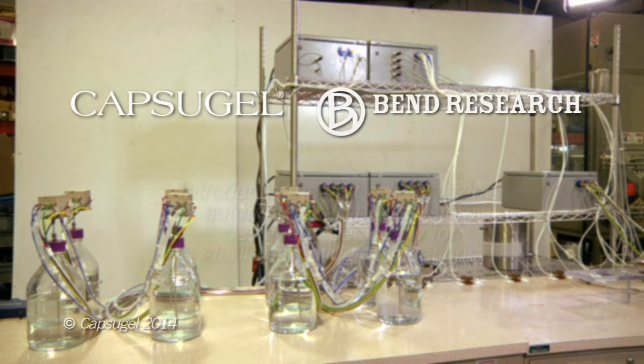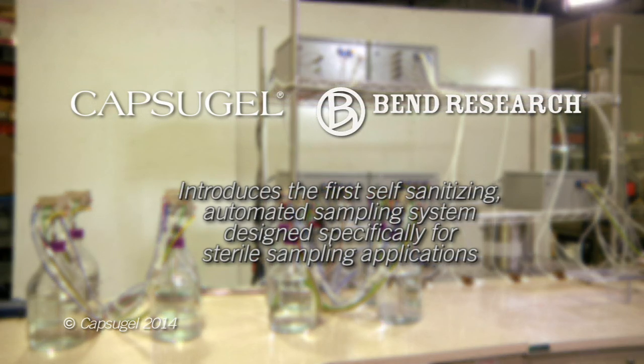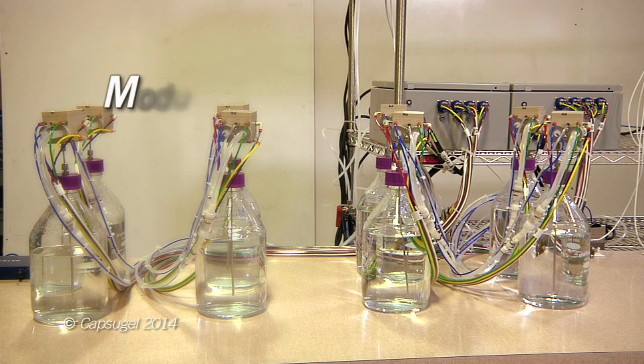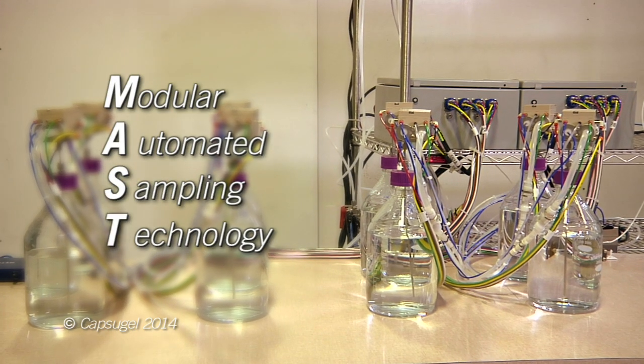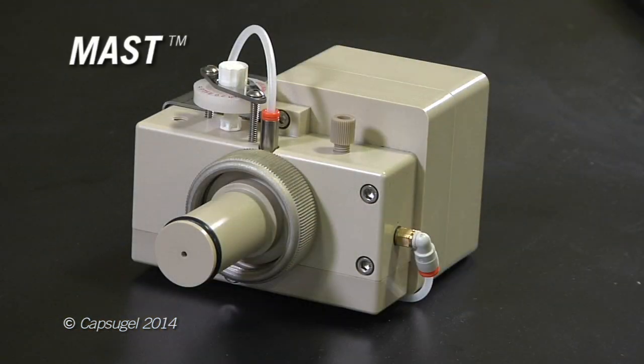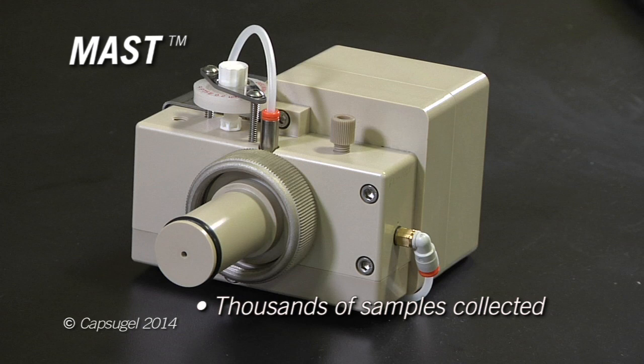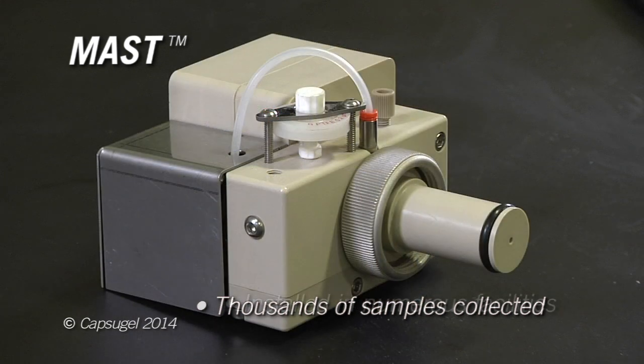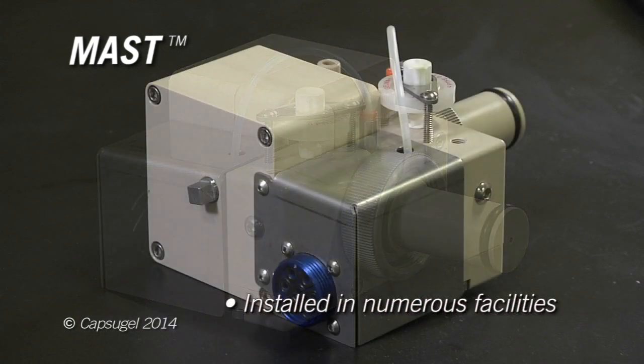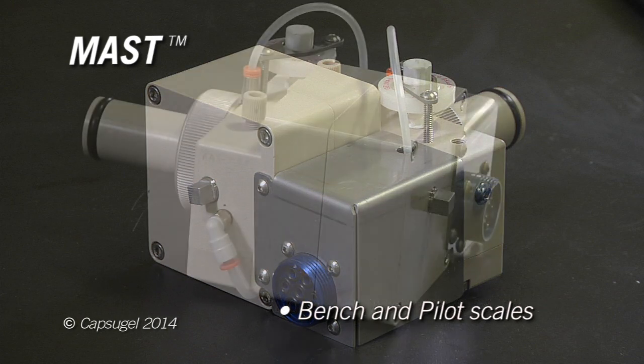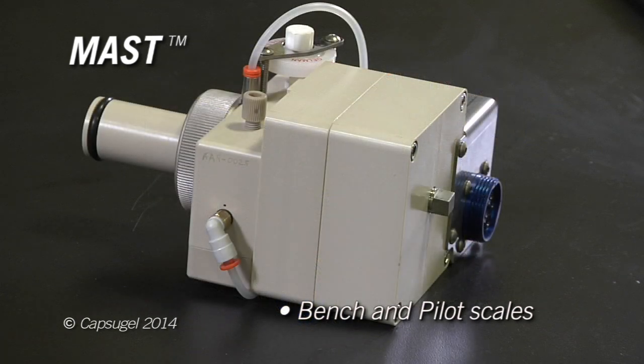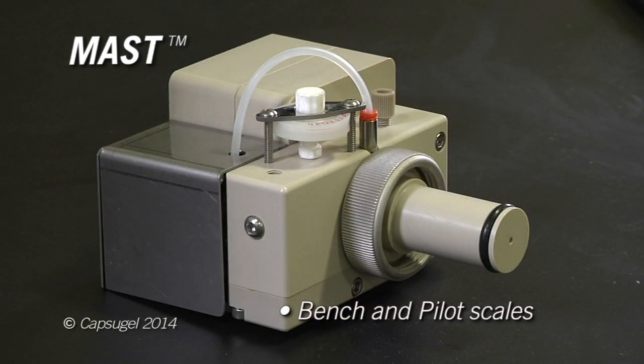Introducing the first self-sanitizing automated sampling system designed specifically for sterile sampling applications, such as bioreactors. We call it the MAST. The MAST system has demonstrated reliability, collecting thousands of samples in multiple facilities. MAST systems have been used at the bench to pilot scales in microbial and mammalian cell culture applications.